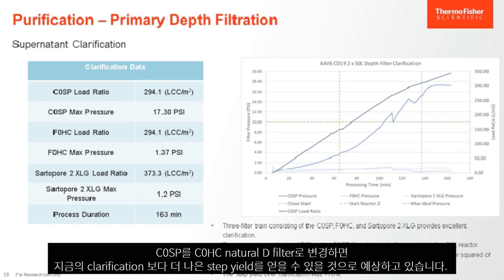We do expect that the potential to move from the C0SP to a C0HC natural DE filter that we were not able to obtain at the time of this purification might allow us to have an even better step yield over this clarification step in the process.